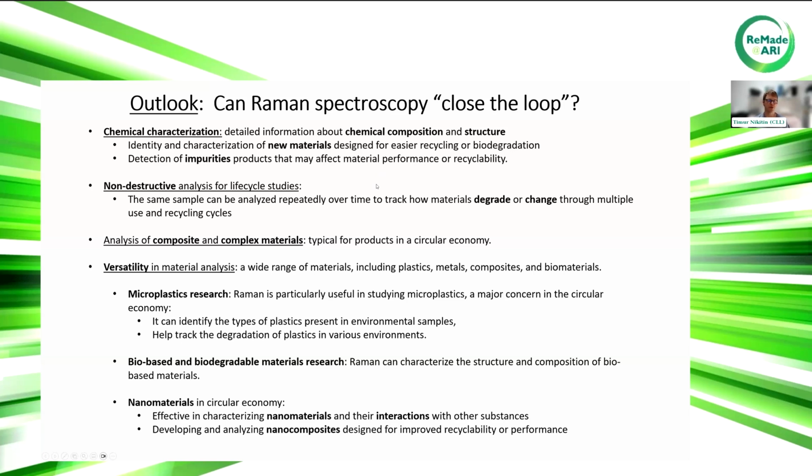The next important advantage of the technique is that this is a non-destructive analysis. The same sample can be analyzed repeatedly, if necessary, over time to track how materials degrade or change after some time or after recycling cycles.